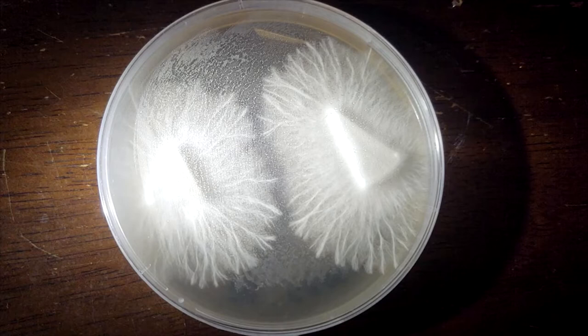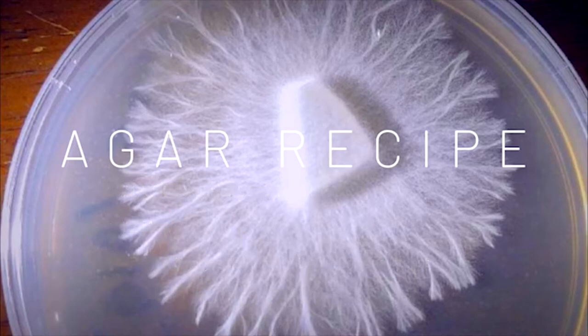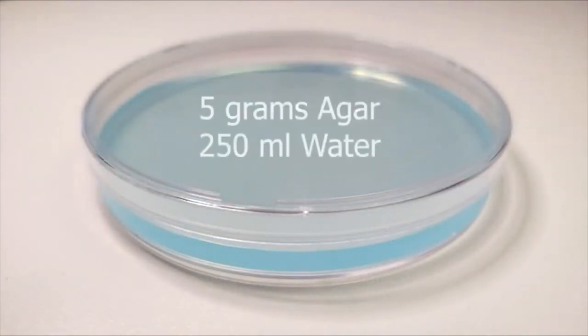The more nutrients you add, it seems to spread out in a more fluffy tomentose style, eating on all the abundance. As you research, you find that rhizomorphic and tomentose will both produce beautiful mushrooms, but it's easier to determine the most viable points to make successful transfers due to the antlering in rhizomorphic growth. Our water agar recipe is simply 10 grams of agar to 500 milliliters of purified boiling water.